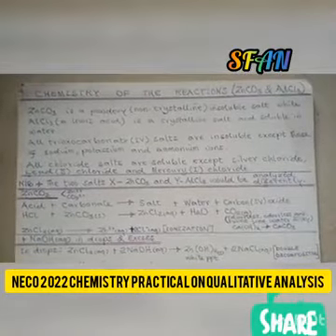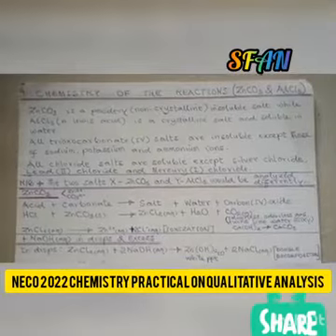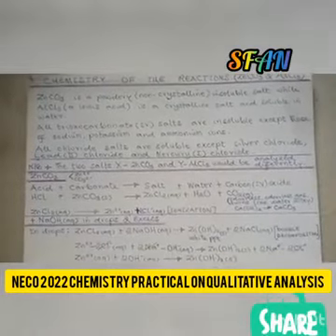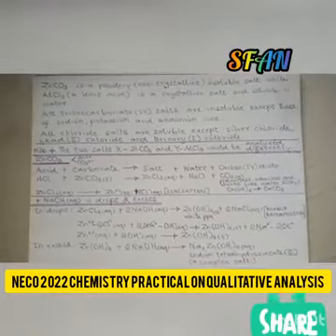To avoid cramming, we have put down for you the chemistry of the reactions that take place.